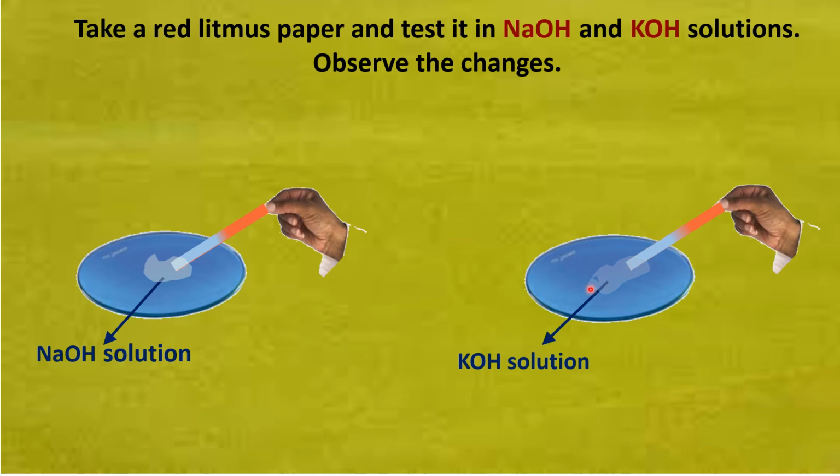So you remember these changes. Now we'll see for the other two solutions, that is magnesium hydroxide and then ammonium hydroxide solution. What happens?